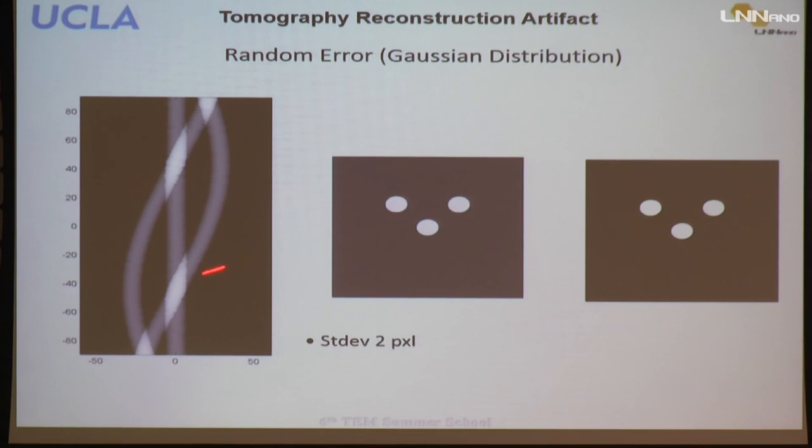And during the alignment, there are usually random errors. Usually a lot of projections have noise. You cannot get noise-free images from the TEM, and due to noise, your alignment cannot be perfect. So there's random wiggling here in the sinogram; you can see it's not very smooth.